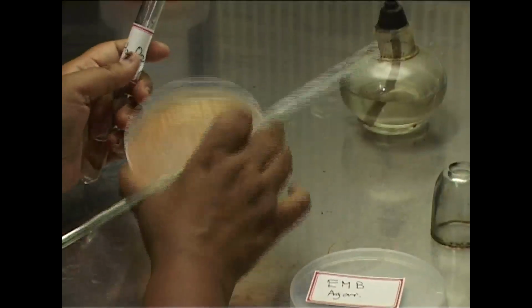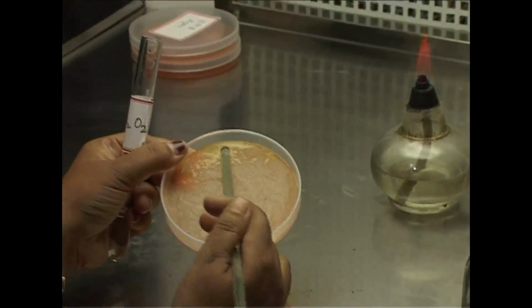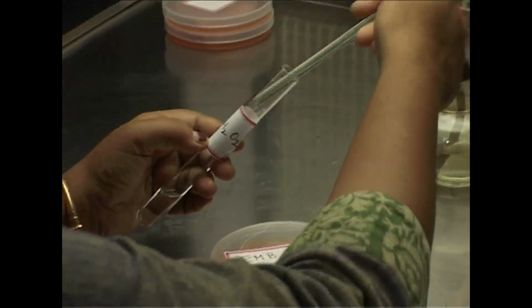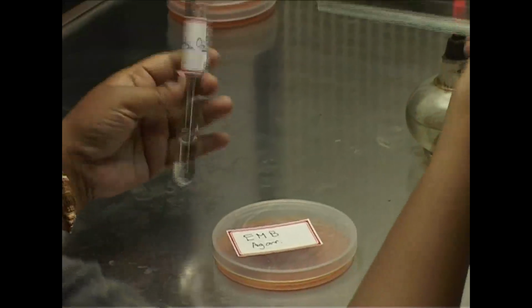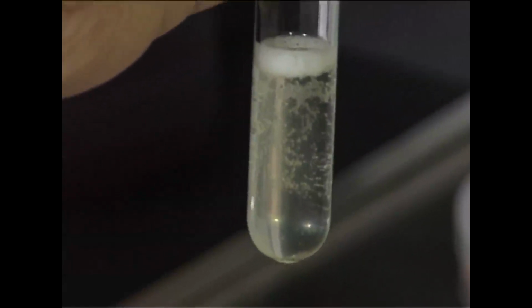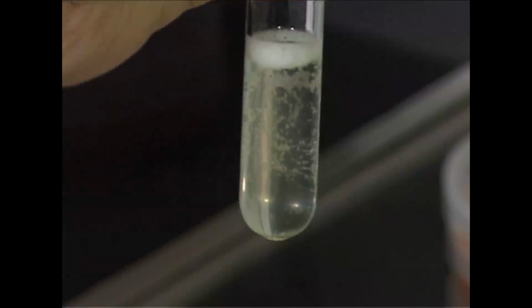3 ml of catalase reagent, that is 3% H2O2, will be taken inside a test tube, and with a glass rod, a single colony will be taken from the pure culture and immersed inside the test tube. So you can follow the effervescence of oxygen. If catalase is present, it will help to break down H2O2 into H2O as well as oxygen.